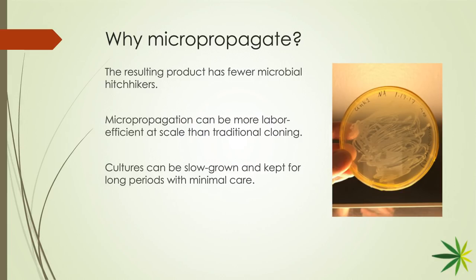But if you micropropagate under the right culture conditions, you can get rid of these kinds of hitchhikers, the ones on the surface and ones that are in the cells. The smaller the microbial hitchhiker, the more challenging the eradication. But bacteria tend to be.